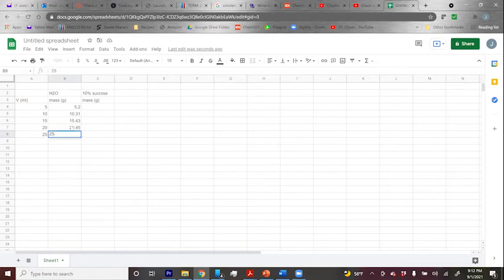25, 33. All right. So there's my masses of the water, and they look pretty good. Sort of what you would expect.